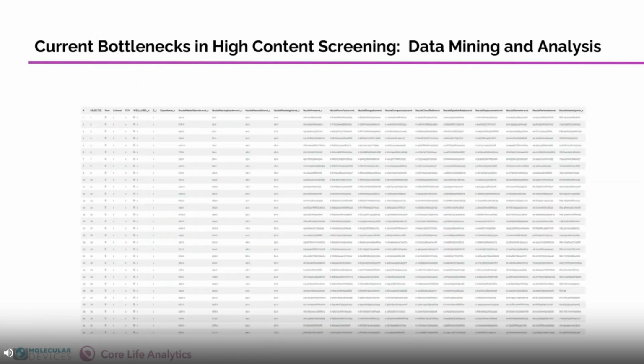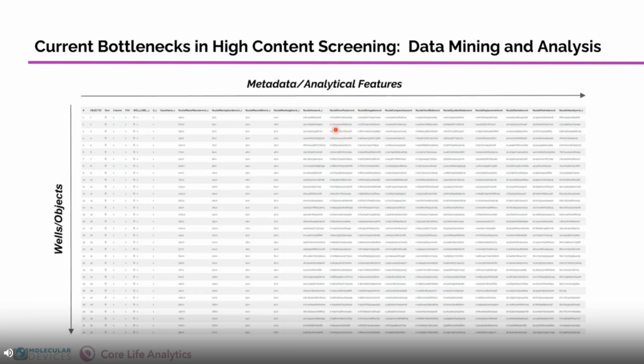When it comes down to high-content screening, the data that you get after image analysis is not quite a simple case of plugging in formulas and reformatting your data as you typically would in Excel or GraphPad Prism, predominantly because of the volume of numerical values that Angeline had extracted from her image analysis software. Her segmentation process extracted 250 different measurements, and this table here of numerical values only shows a small part of the 250 features spanning across the table here and beyond.